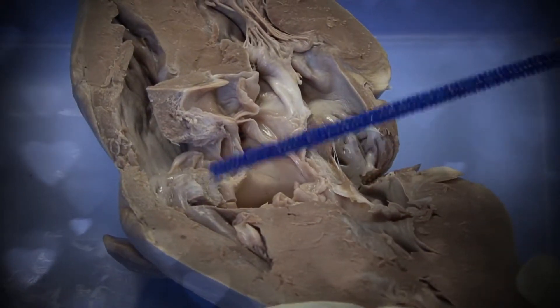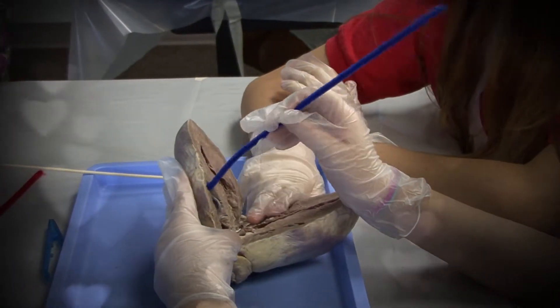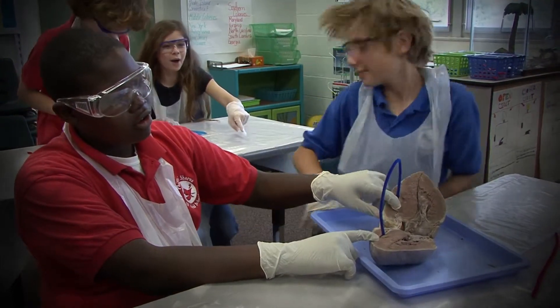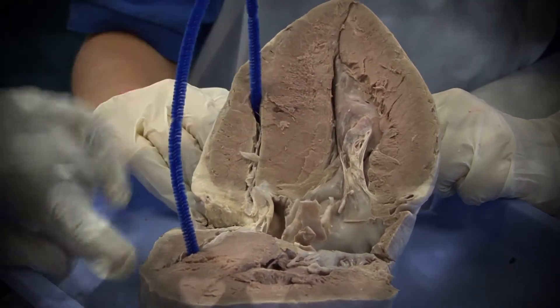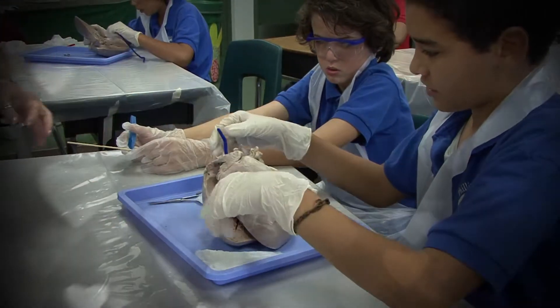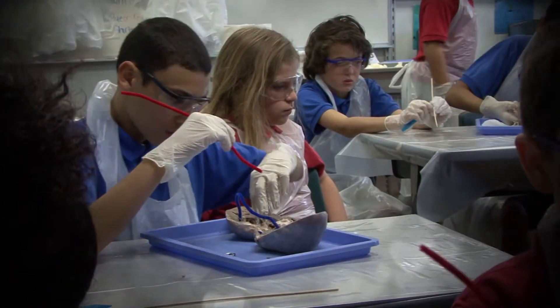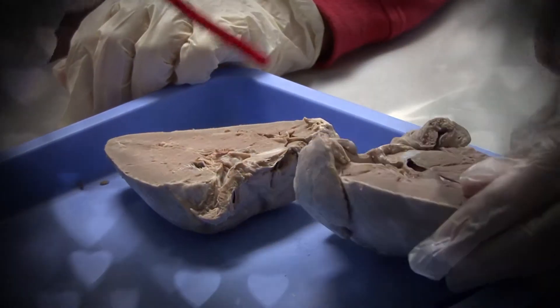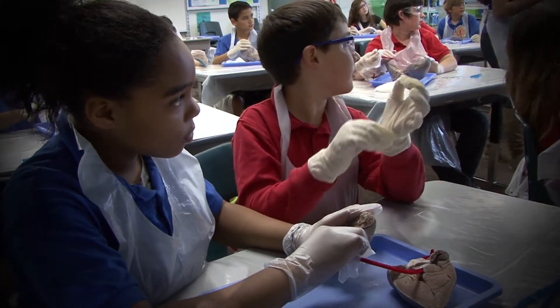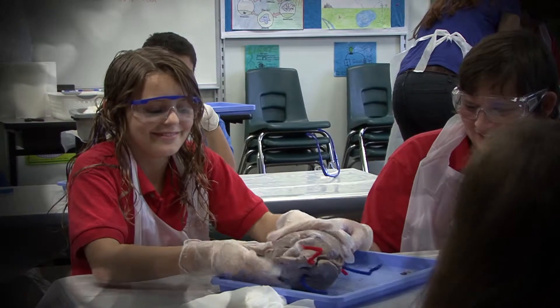I want everybody to take the blue pipe cleaner and point to the right atrium and right ventricle. Can you tell that the right atrium is considerably smaller? So we have traced the vena cava into the right atrium and right ventricle. Now take your red pipe cleaner and locate your left atrium and left ventricle. Why is the left ventricle thicker than the right ventricle?